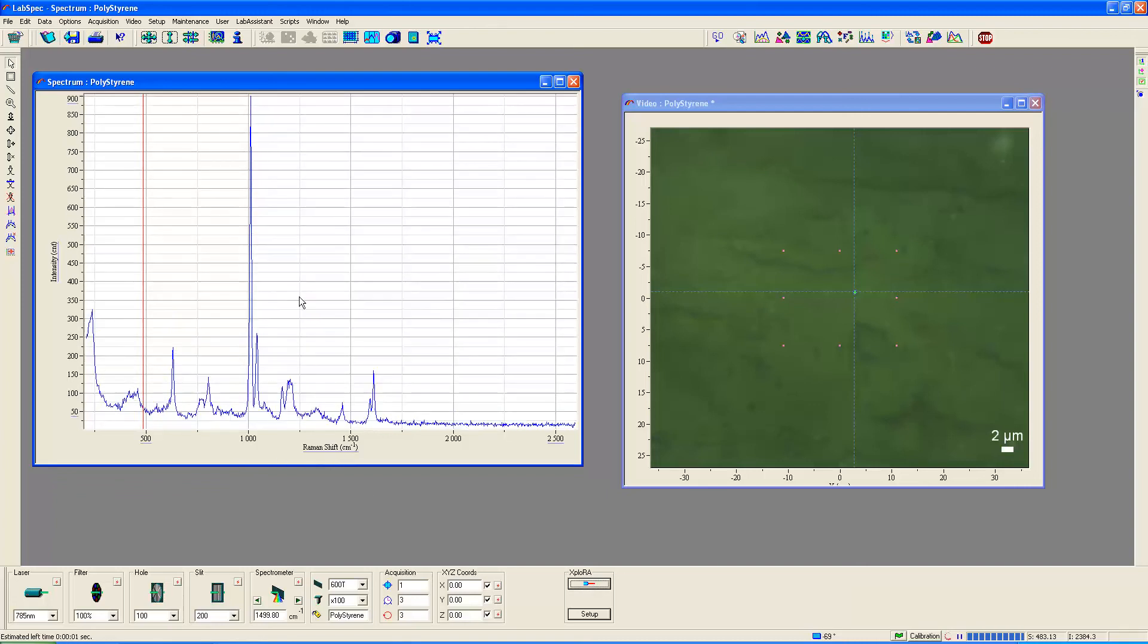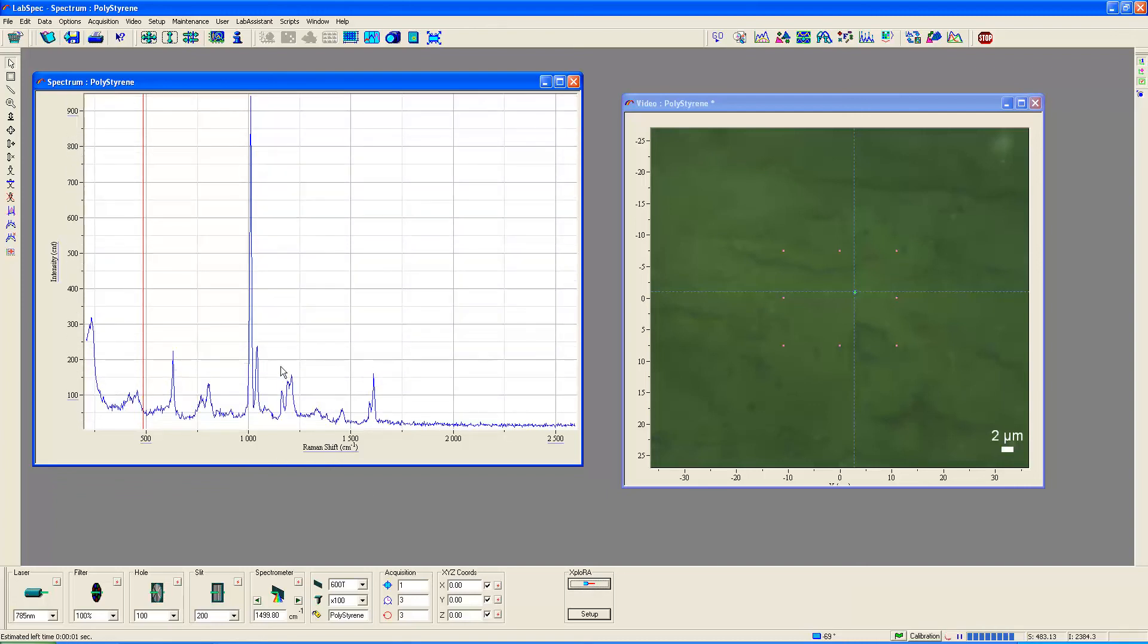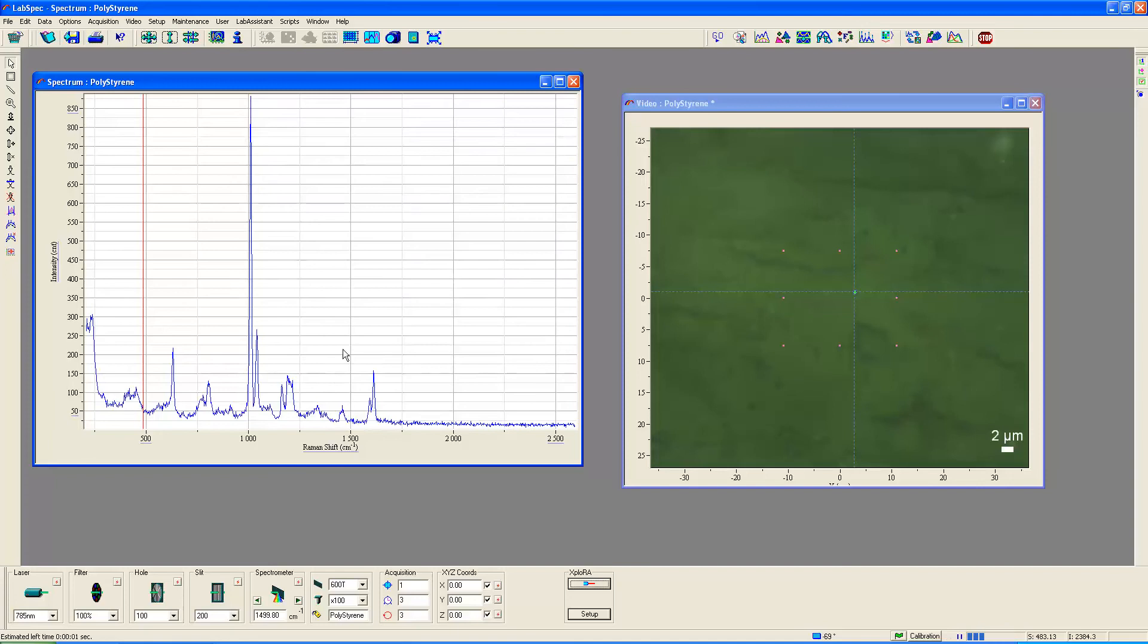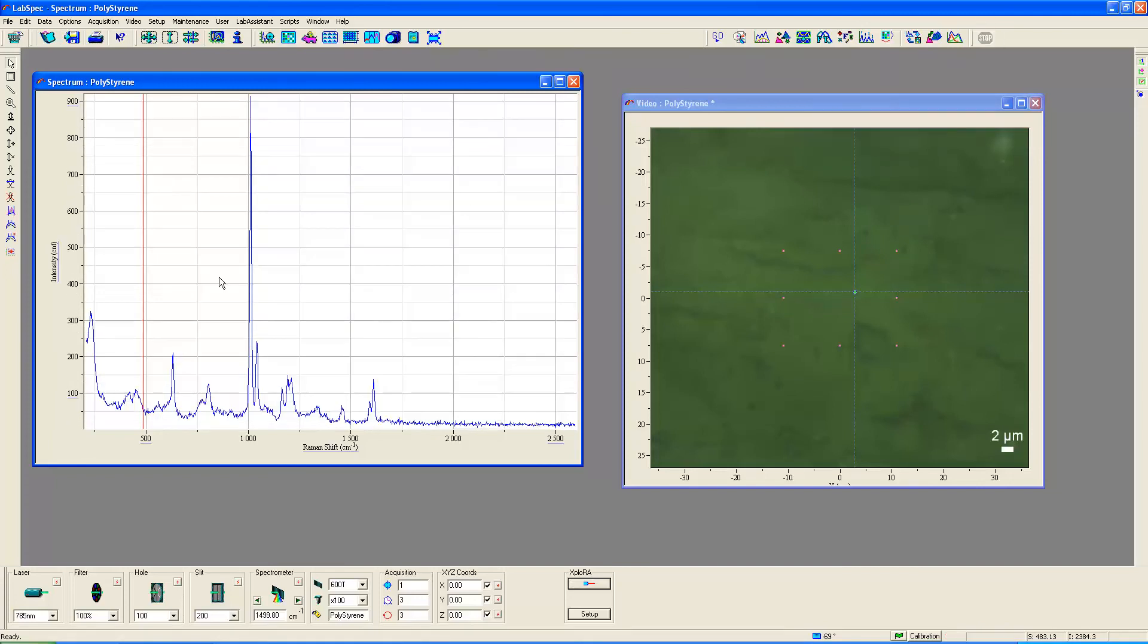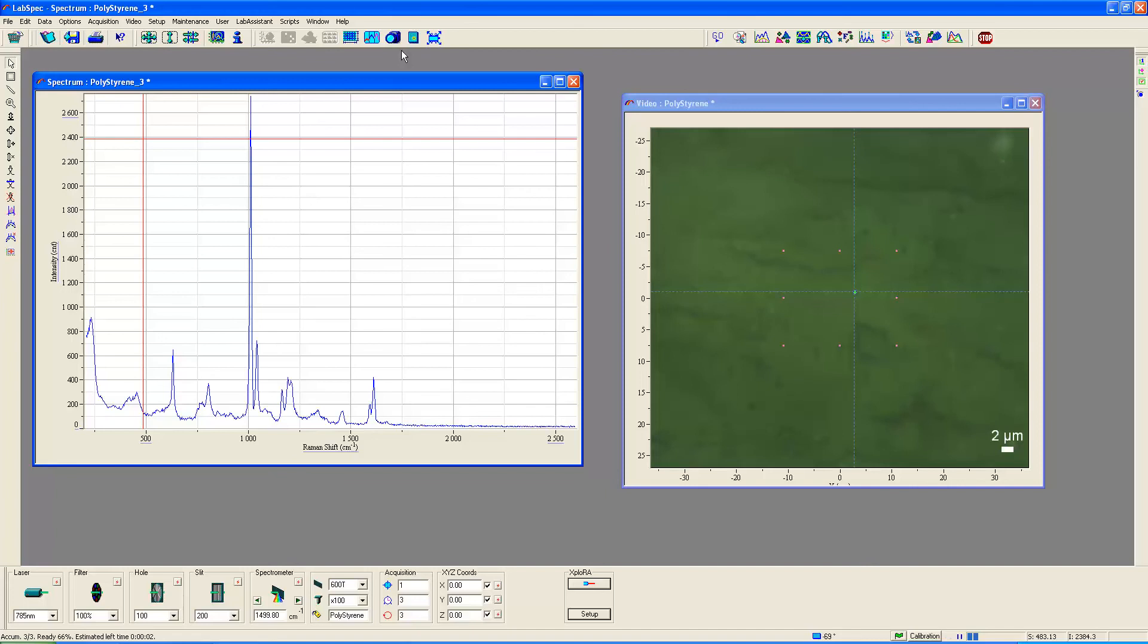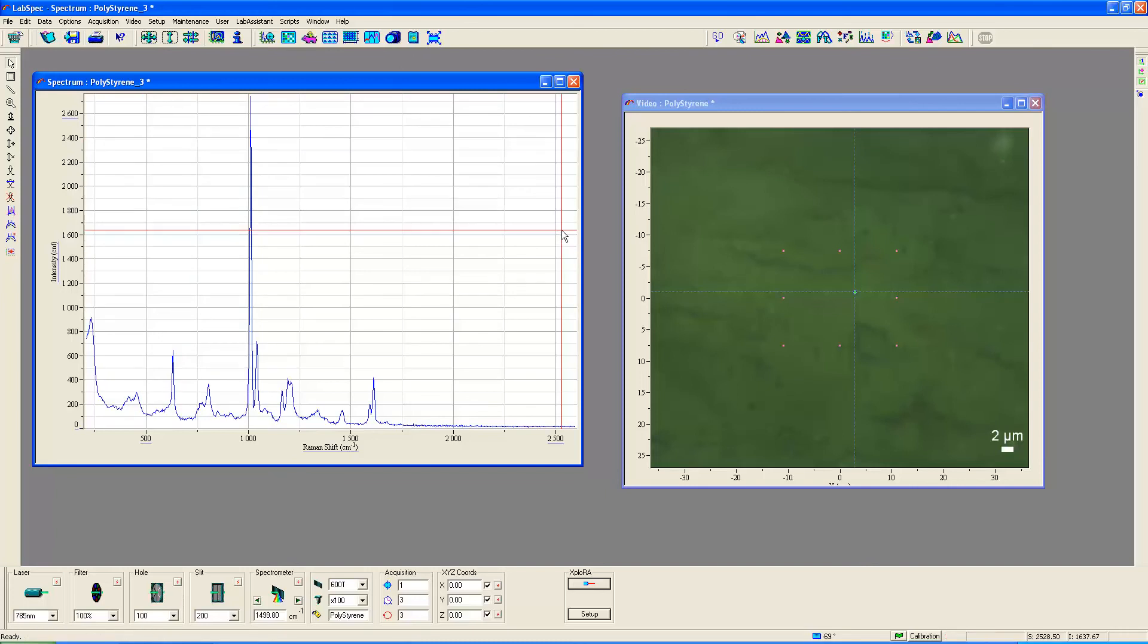So now, as you see, we get a very nice real-time spectrum of polystyrene. And let's, while we're at it now, let's click this button up here, the piggy bank. And now let's acquire a spectrum with the beam focused on the surface of this polystyrene. There's our spectrum that we've acquired.